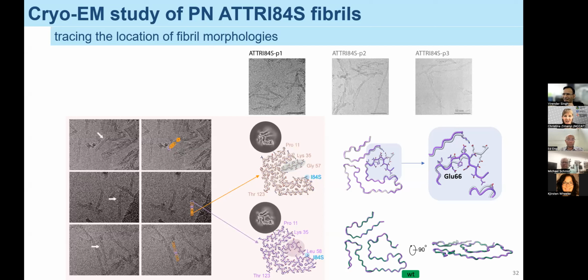Is that a matter of changing your box size during extraction? Not really box size. In the normal pipeline, we use an interlayer difference of about three layers, so mostly we use an overlap of three layers.